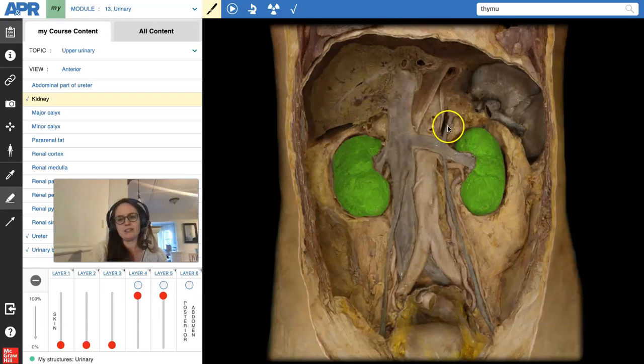I kind of already talked about it, but the best way to find these is via the suprarenal arteries. Because they look fatty themselves, as you saw from the last view, and the fat around them also looks like fat. So when you're dissecting them out, it's really, really tricky to see where it stops being fat and starts being glandular. Again, a lot of glandy things don't look like much, like that pancreas, for example.